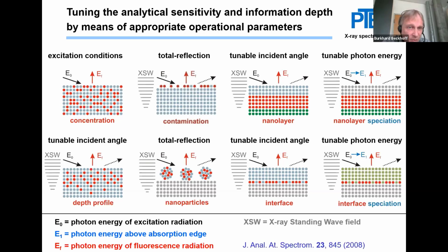And we have seen the requirement of tuning the analytical sensitivity or information depths by means of appropriate operational parameters with respect to the characterization of nano-scaled samples.